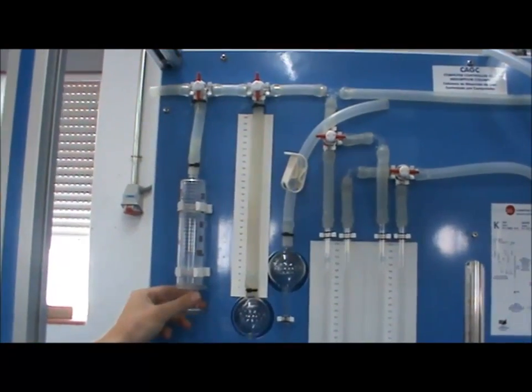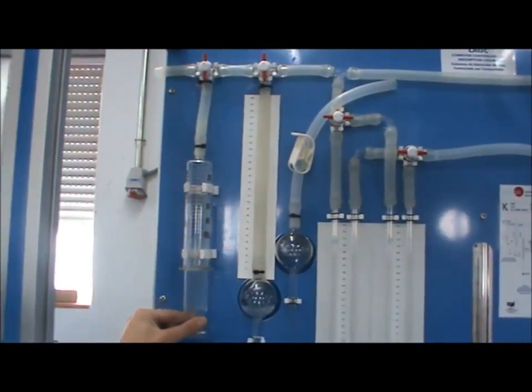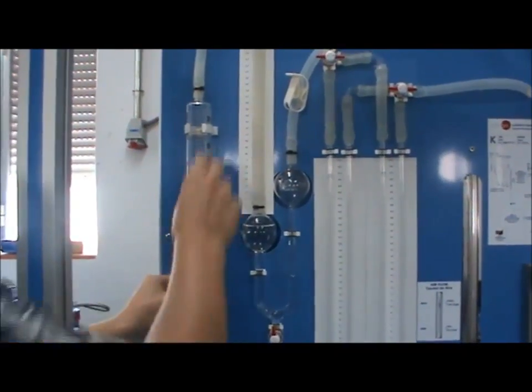Make sure valve V1 is open and push the plunger downwards, sucking the KOH solution up through the U-shaped vessels.